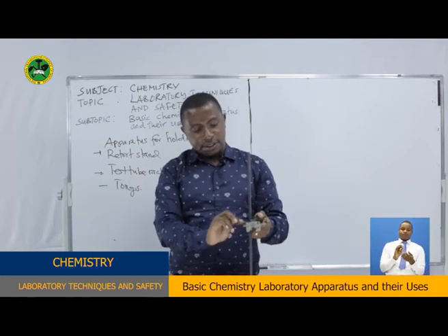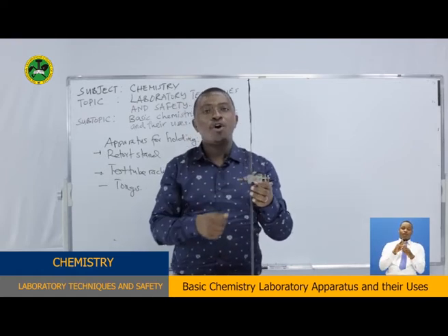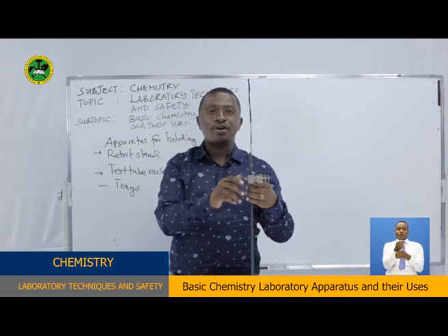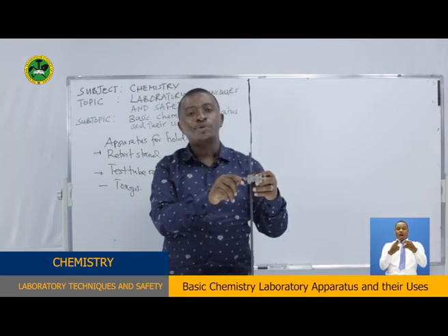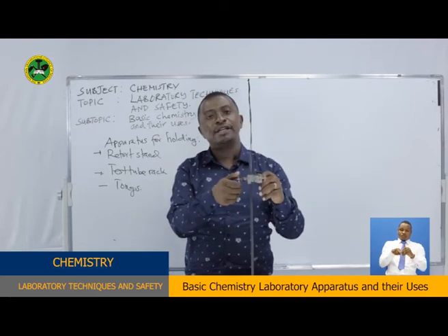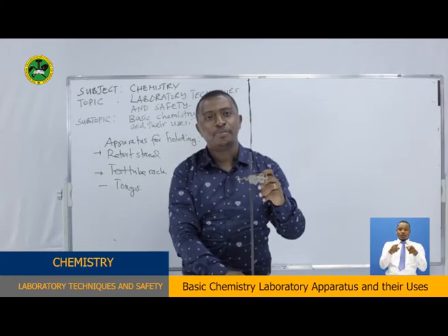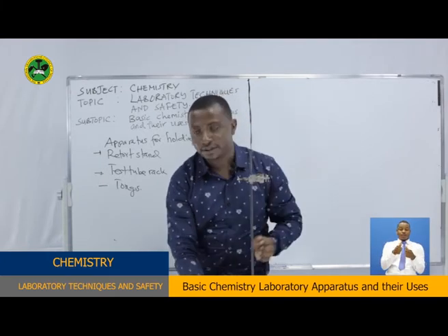This apparatus here is used for holding boiling or test tubes. It is used to support boiling tubes or test tubes with a clamp which can be adjusted to various heights depending on what height you want.